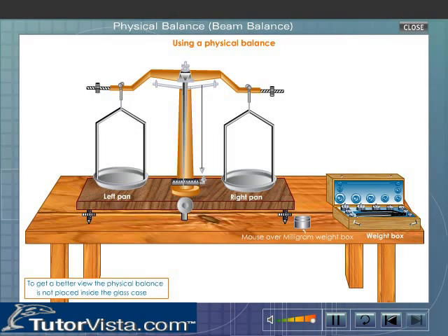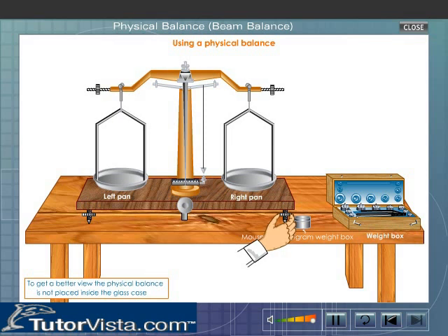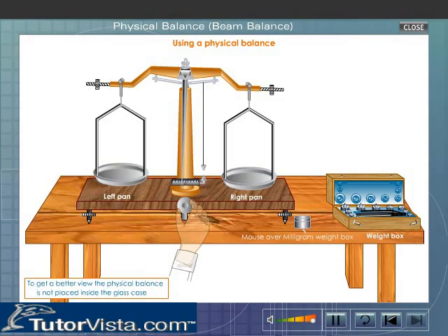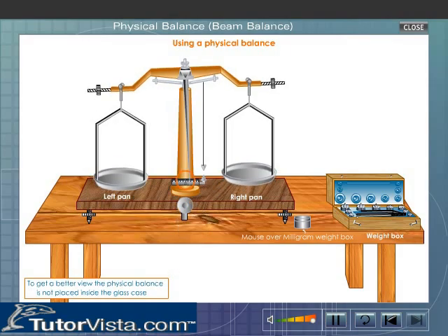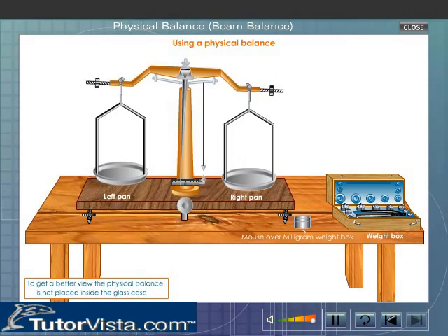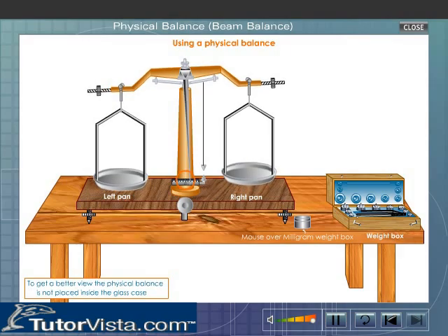Using a physical balance, adjust the leveling screws such that the plumb line points vertically downward. Gently raise the central rod by turning the lever. If the pointer remains at zero mark or oscillates equally on either side of the zero mark, then the balance is fully adjusted.